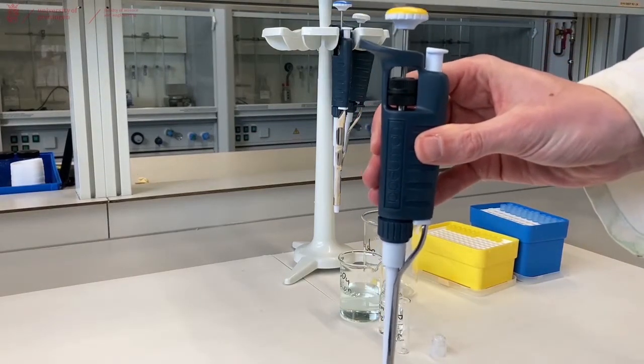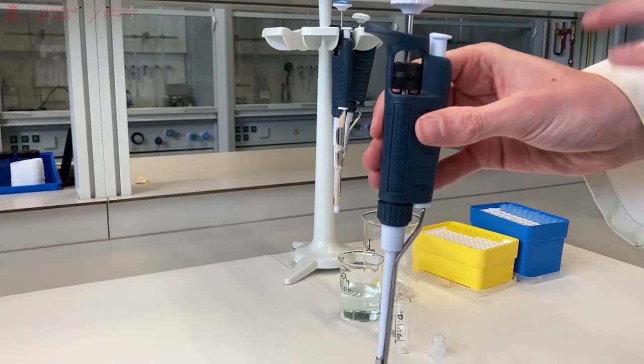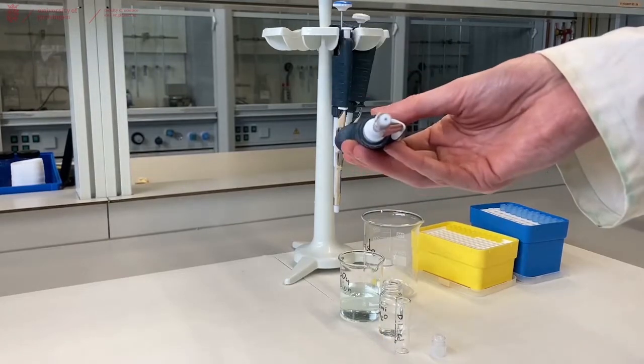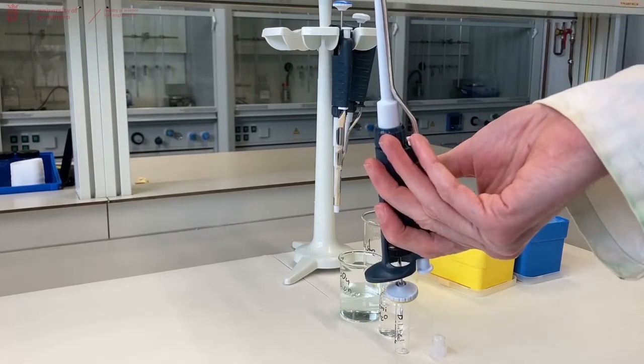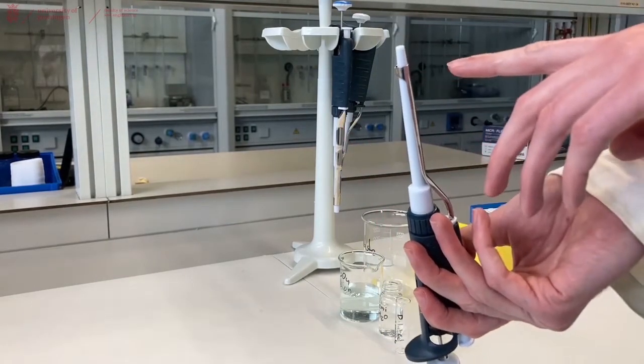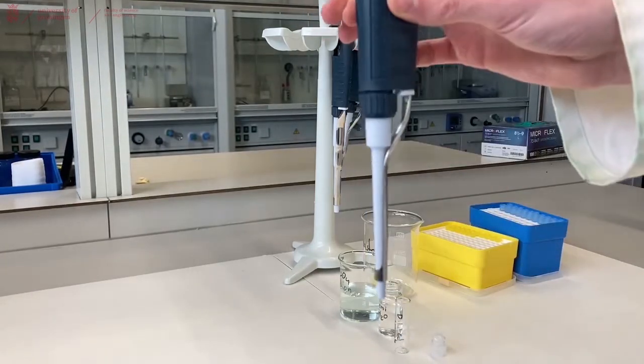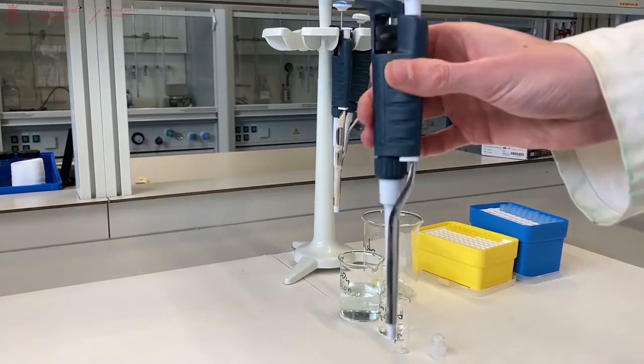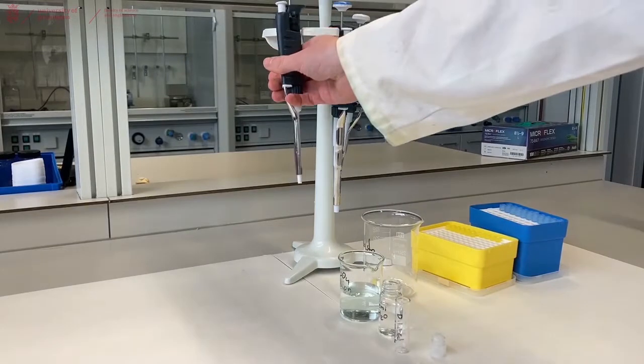What you should never do is, when there's any liquid involved, hold the pipette sideways or upside down, because then the liquid will go into the mechanism and slowly destroy the pipette. Always keep your pipette upright, and when you're done hang it back on the stand.